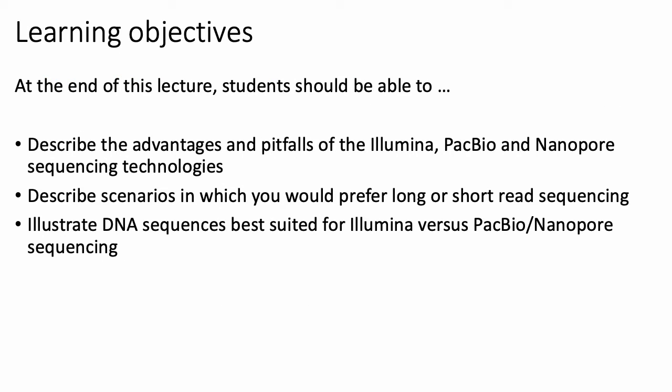And so the learning objectives today are really just to understand the advantages and disadvantages of the three main sequencing technologies that a lot of people use today, namely those made by Illumina, PacBio, and Nanopore, and have some broad understanding of how they work. And also we want to understand when and why you would use long versus short read sequencing, because long and short read sequencing have their own advantages and disadvantages in general.